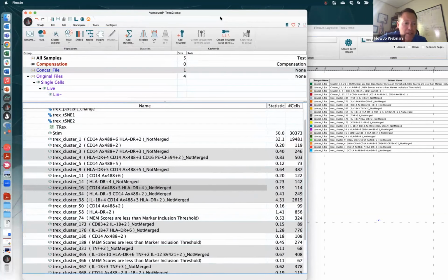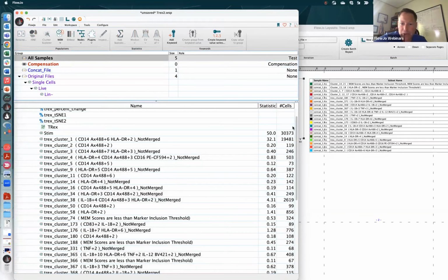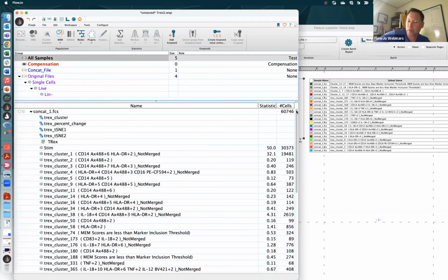Okay, let's see. 14 minutes or so left. Let me show you how Embed works. All right, I'm going to go to all samples here, but first we have a question.